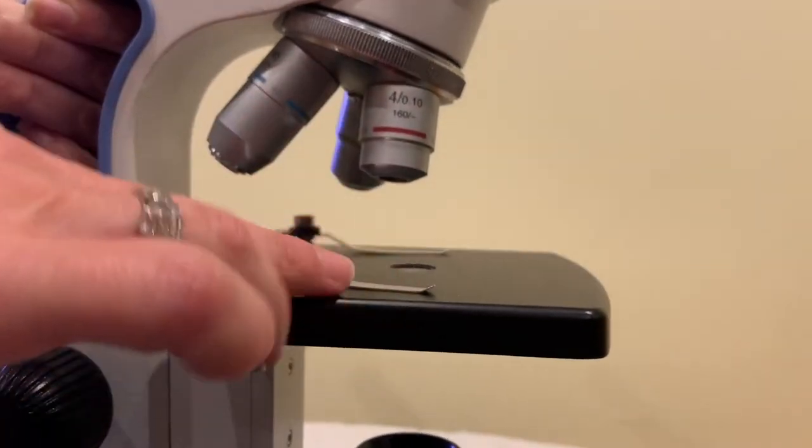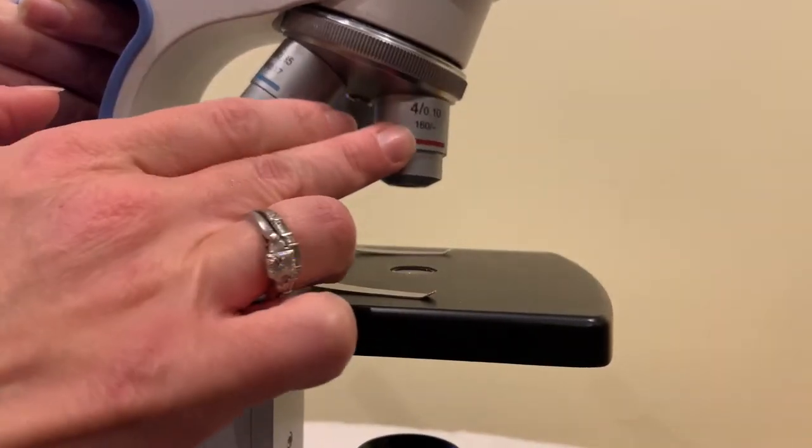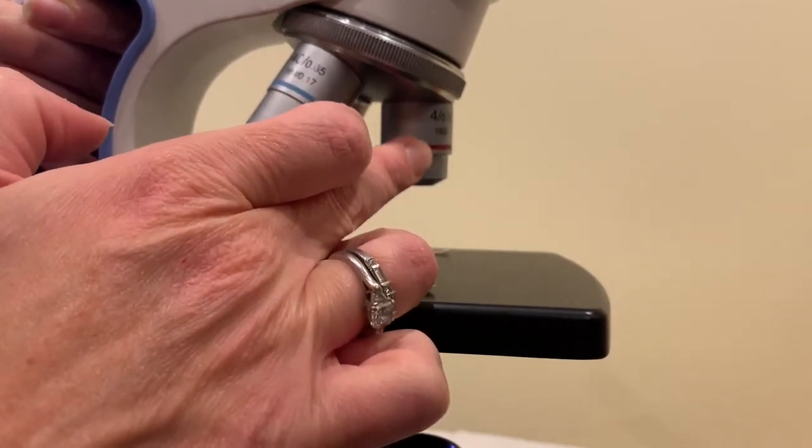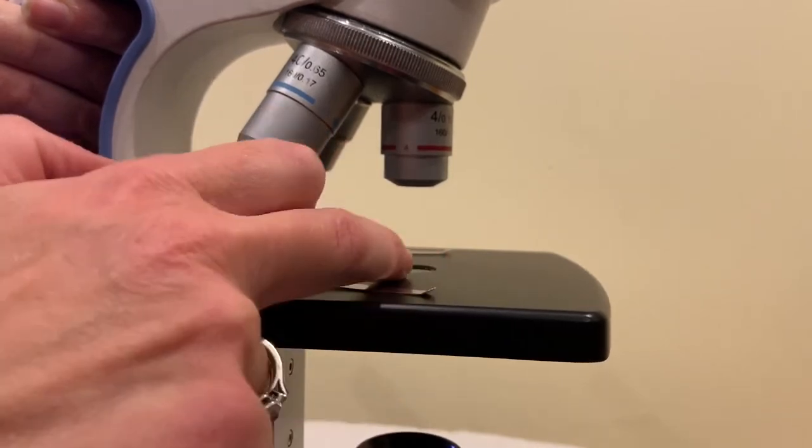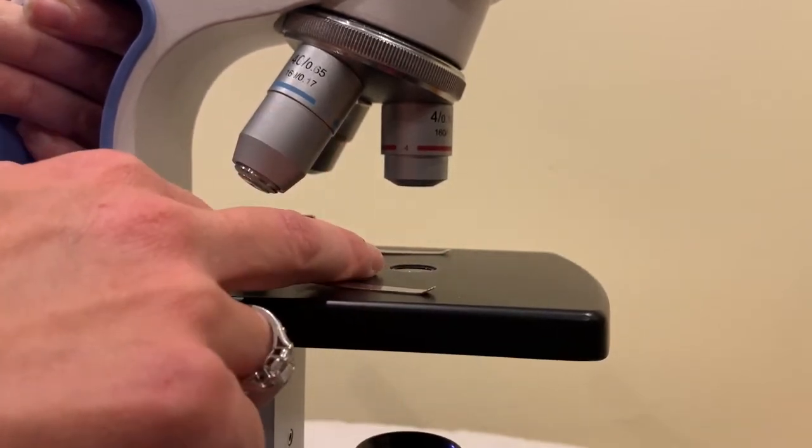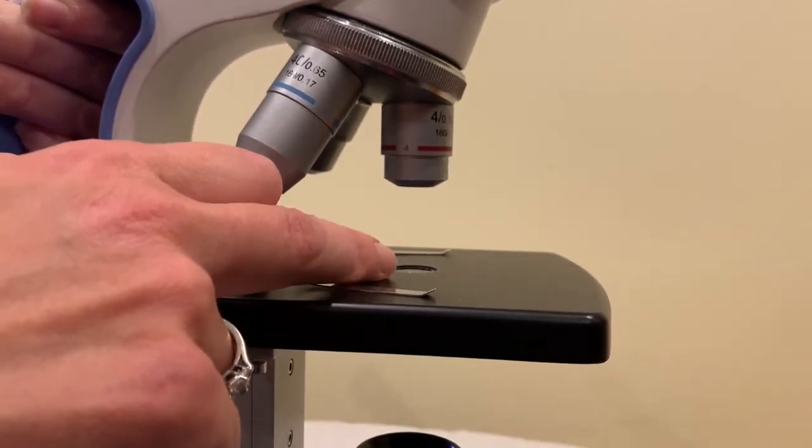So when you have your sample here and the objective lens is pointing down and you look through the ocular lens, your sample will look 40 times larger than it would with the naked eye.